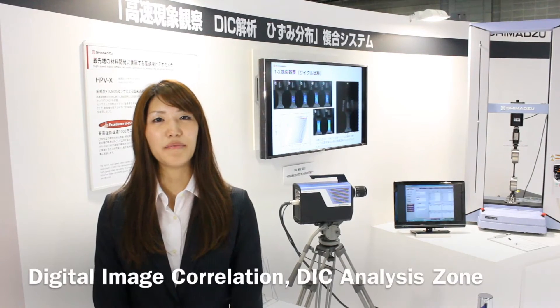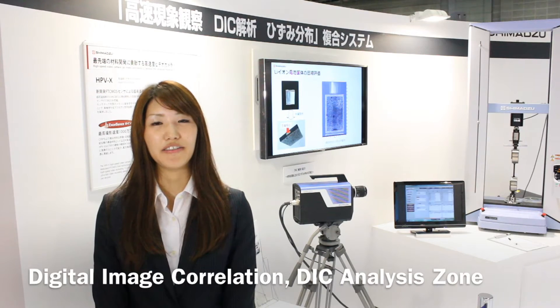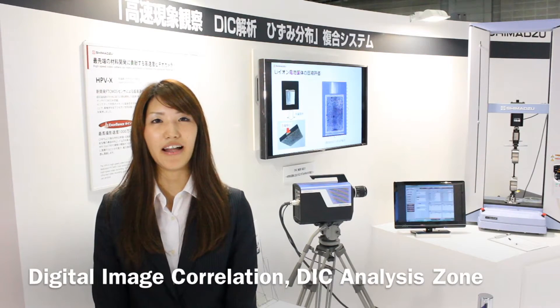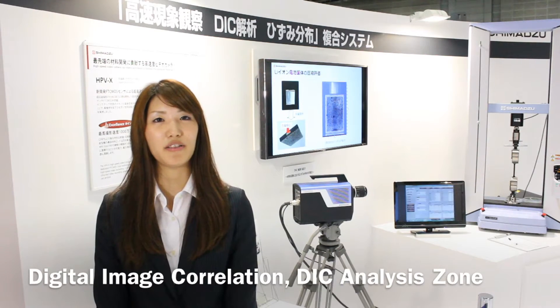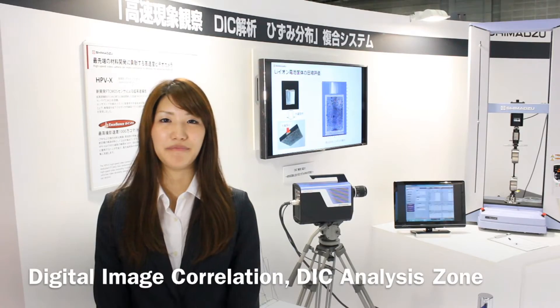This is a hybrid system zone for digital image correlation, DIC analysis at Shimadzu's booth of test 2013.